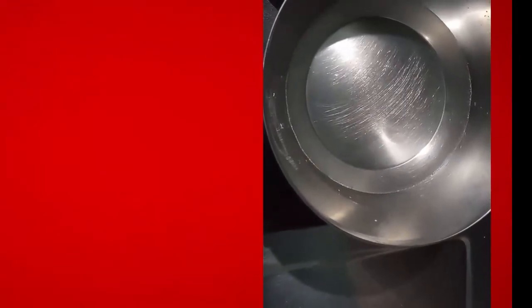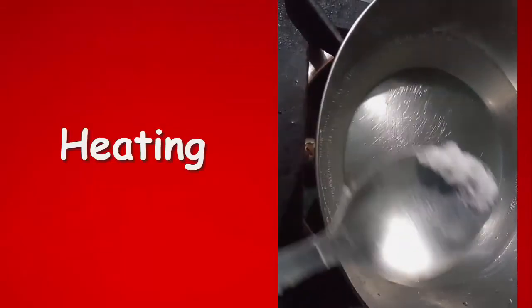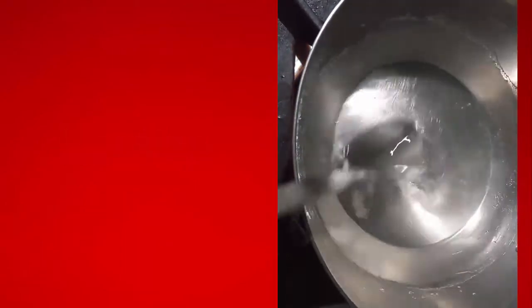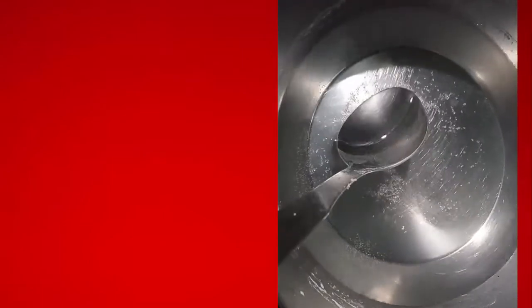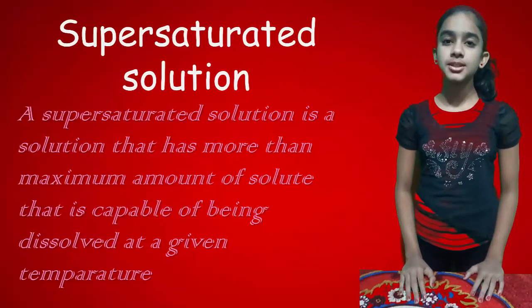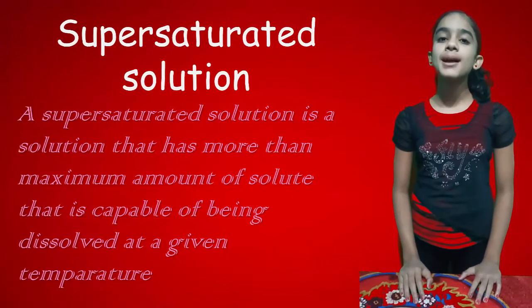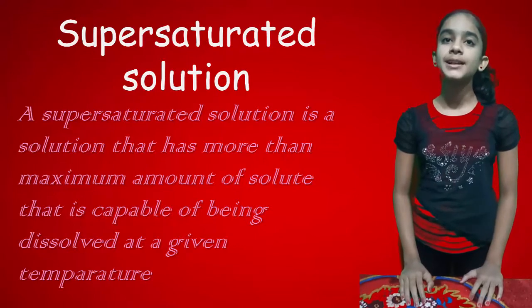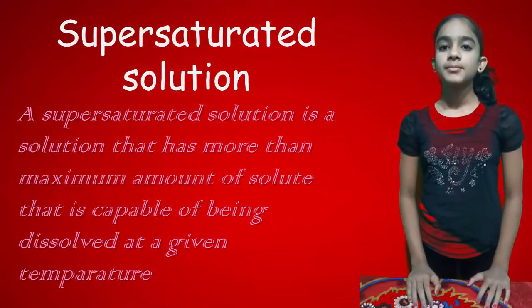Let's heat it and add salt into it. See, the salt is dissolved. More salt is not getting dissolved now. A supersaturated solution is a solution that has more than the maximum amount of solute that is capable of being dissolved at a given temperature. Thank you.